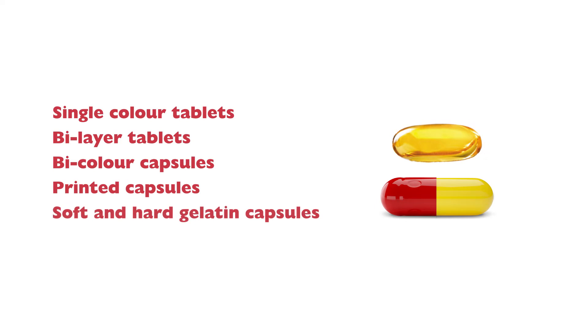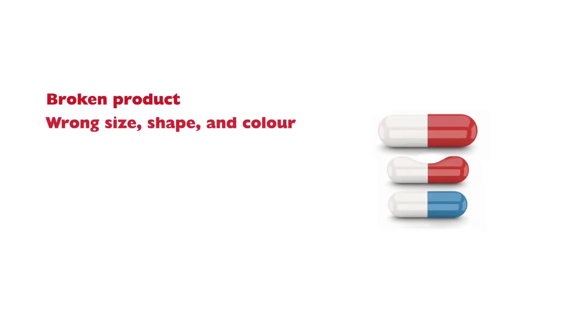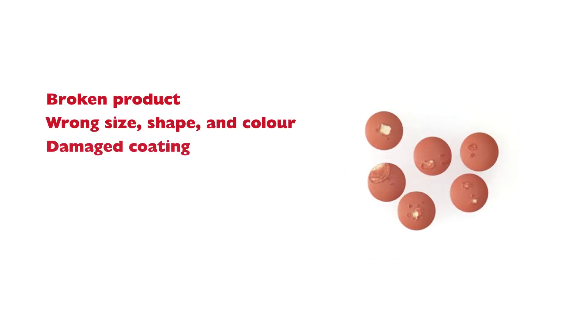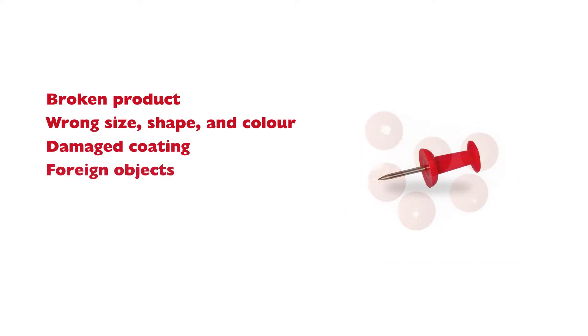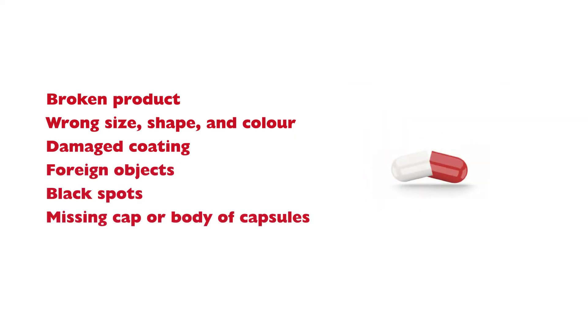QualiShield BF Series can detect broken product, wrong size, shape and color, damaged coating, foreign objects, black spots, missing cap or body of capsules, and many more.